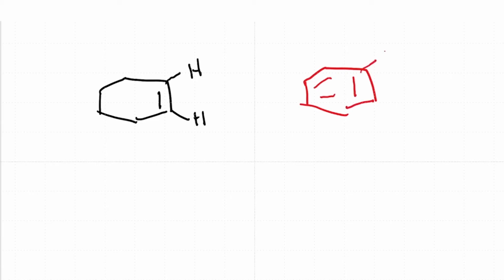You may recall that when you compare the chemical shift value for an olefin, these hydrogens, versus these hydrogens, or any of those hydrogens, the chemical shift value here is about 5.68, whereas here it is 7.27.